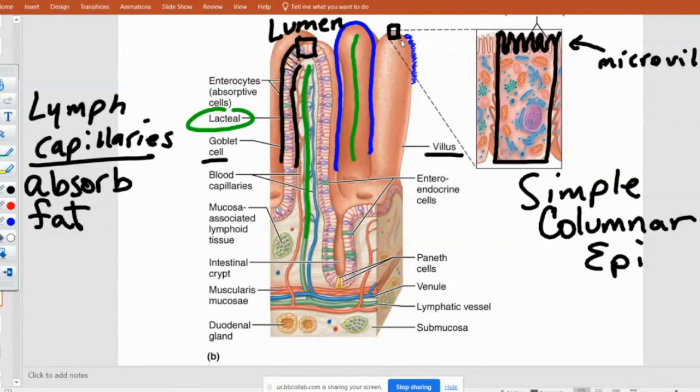But not just there. Here too. And here too. Everywhere. Right? Every little cell that's sticking out has a little furry tip like that. It's a fold to increase surface area so more nutrients can get in there. The more little spaces you have for contact, the more place for water to move in, for salt to move in, for sugar to move in. So anytime you increase the surface area, you're increasing power of absorption, which is great.